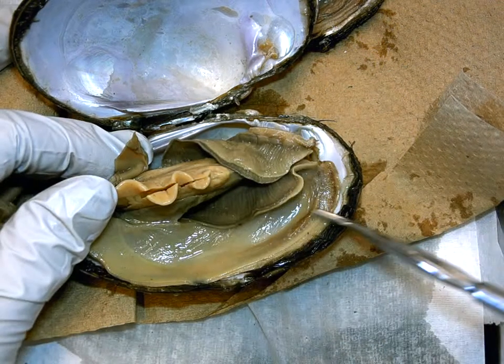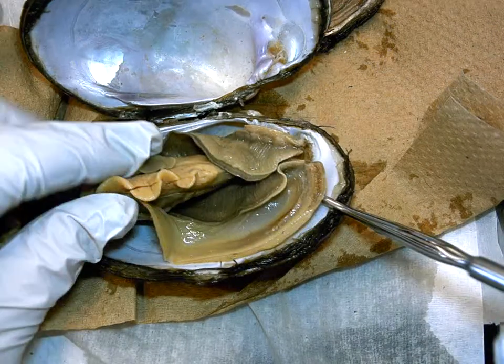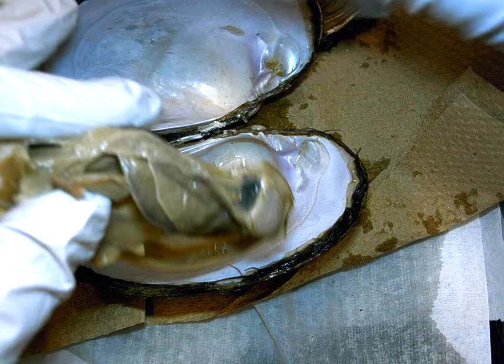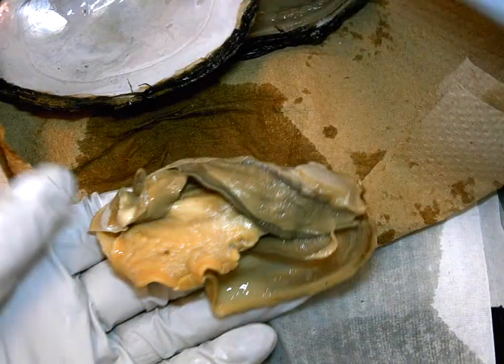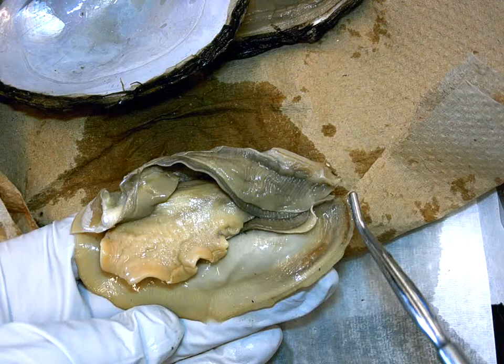You can see here's that thin mantle tissue that secretes the shell. It's already been separated, which allows us to pull the animal off of the shell completely. I can now even remove the entire shell while keeping the orientation from anterior to posterior correct.